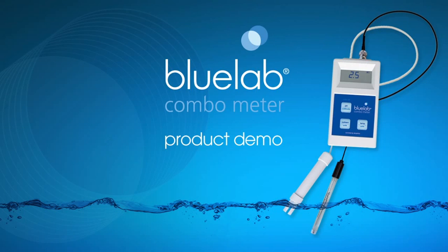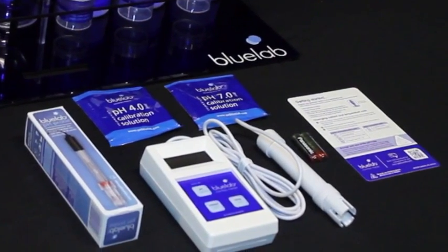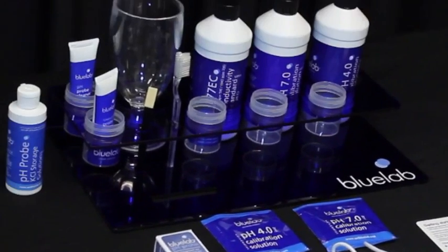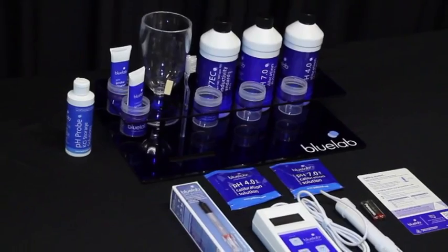Hello and welcome to Bluelab's official video on how to use the Bluelab combo meter. This video will show you how to set up the meter for first use, calibrate the pH probe, and take readings. We will also have tips for care and storage at the end of the video.